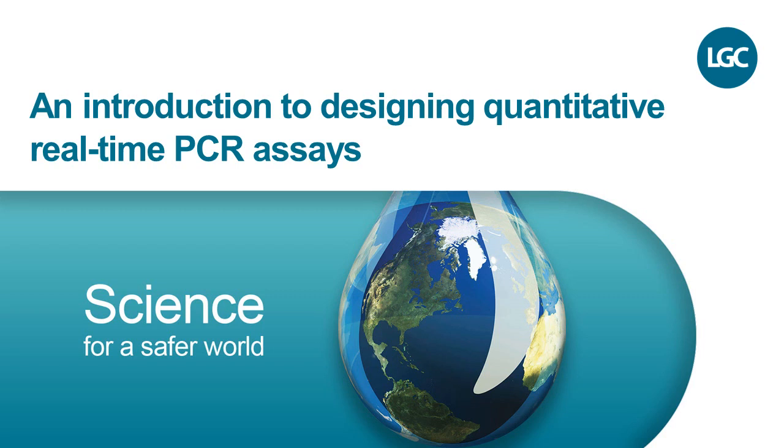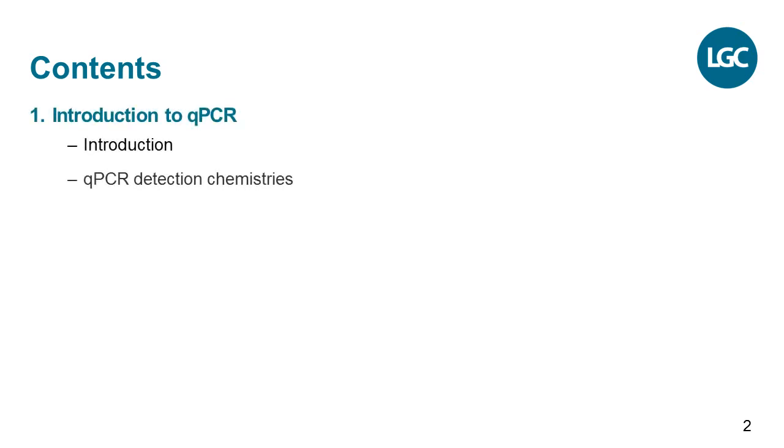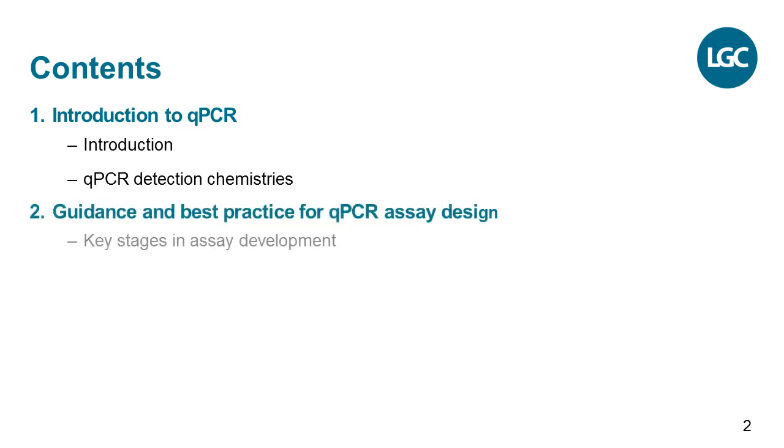Hello and welcome to this e-seminar, which will provide you with an introduction to designing real-time quantitative PCR assays. This e-seminar will introduce you to quantitative real-time PCR and provide guidance and best practice on how to design, optimize and evaluate the performance of custom qPCR assays.